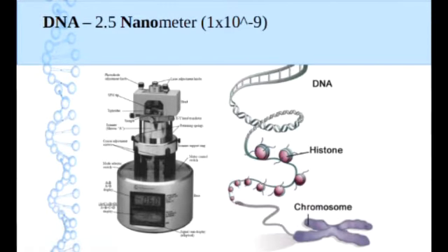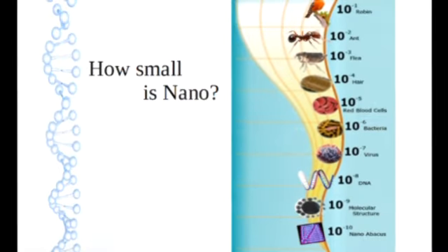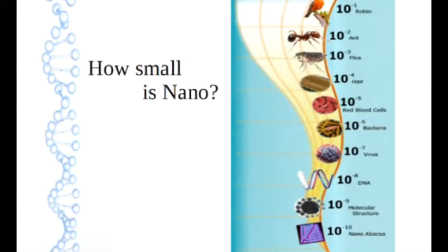For example, I've imaged DNA, which has a width of 2.5 nanometers. This strand is coiled around these histones, which then wrap around to create a chromosome. The chromosome is now considered too small relative to a 50 micrometer cell. This is a 3 order of magnitude size difference.